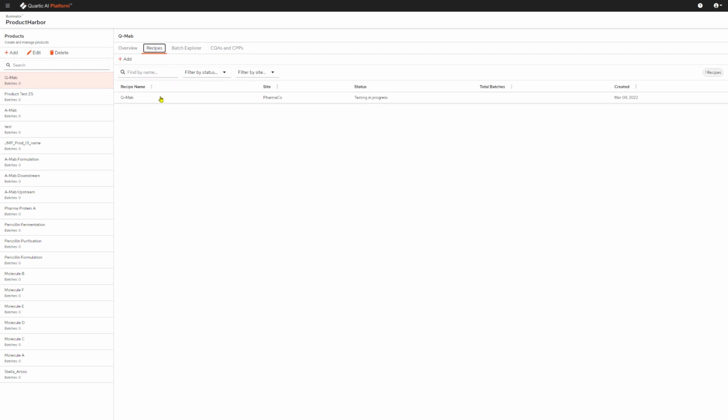You can also check the status on this as it's running. You can see this testing in progress. So we'll just wait for this to complete. All right, great. So you can see that our status is now updated to testing completed. So now I can come in and view the results of that.